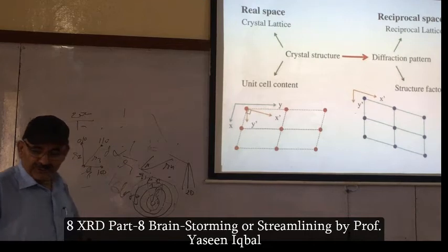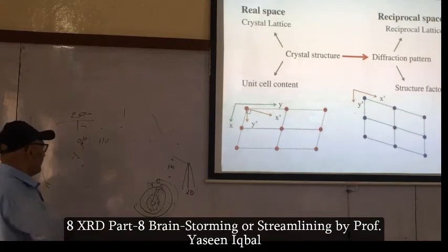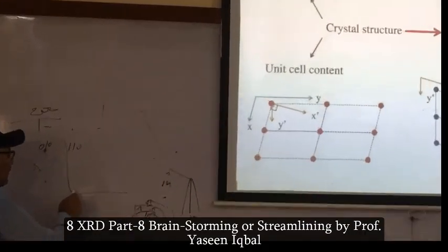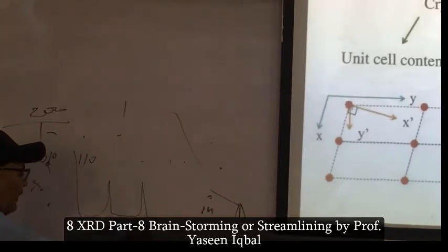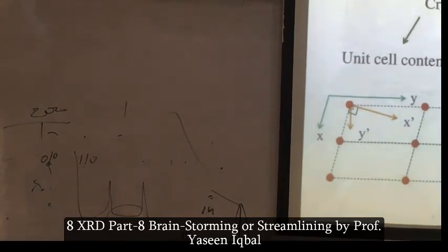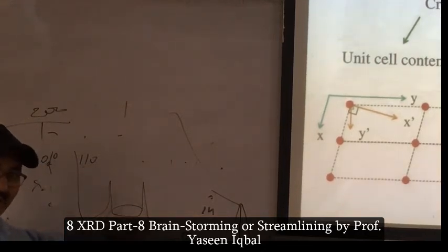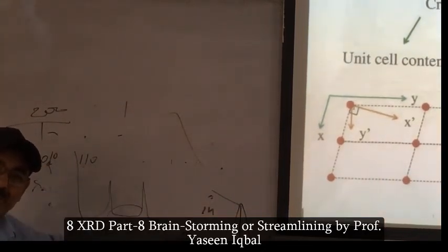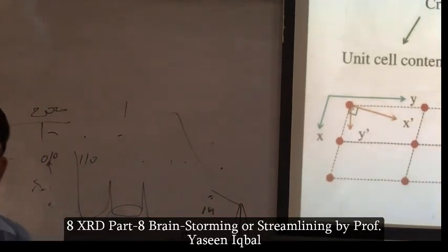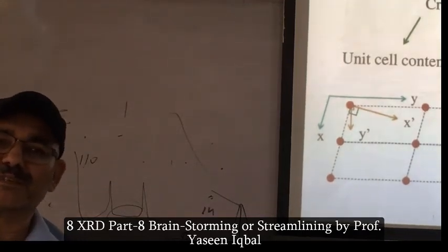And if I am telling you again and again that we have a diffraction pattern like this, then why are we not having peaks here? Because the machine passes through that angle, but when it reaches here, it suddenly starts dropping down and goes like this, and then starts to jump. Why? So why is the interference becoming destructive?